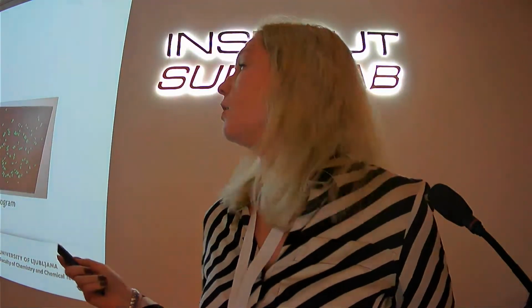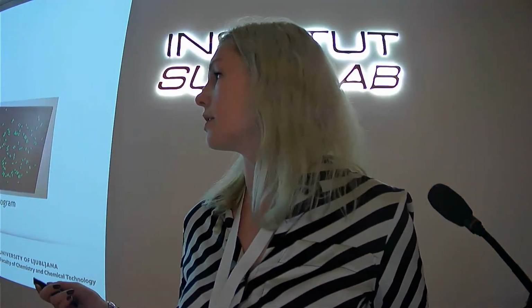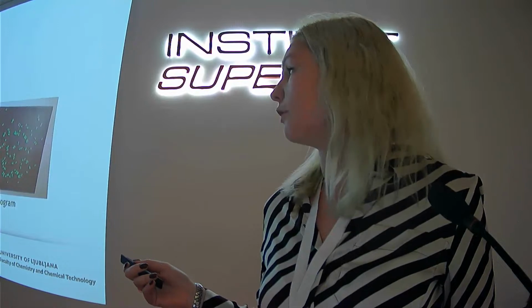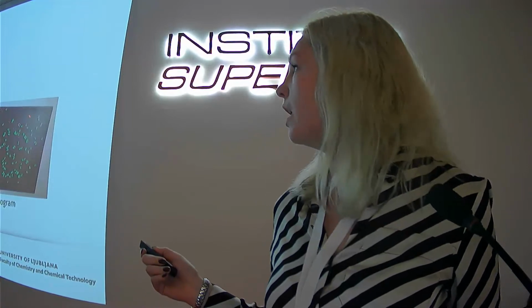But if you have some specific software that can process a picture, we usually just take a picture with the phone, with a scale bar, and then in the AxioVision program that we have, for example, you also have many different programs, the program will detect the particles from the background. Of course, you always need to check, because sometimes it misses some particles that you then need to click manually, and then you can get the size distribution.